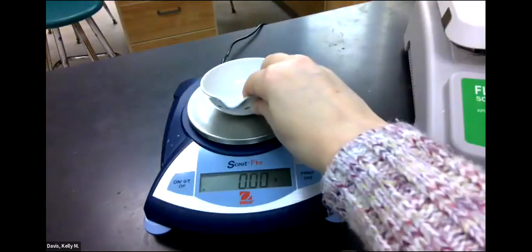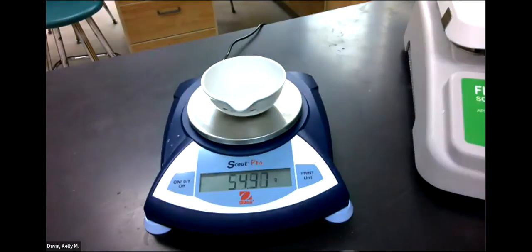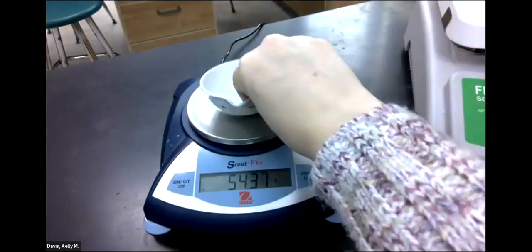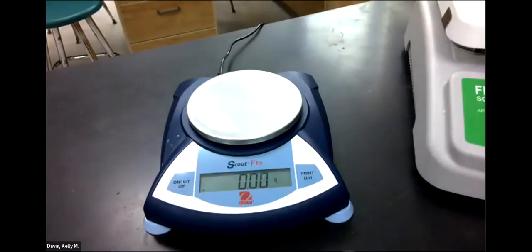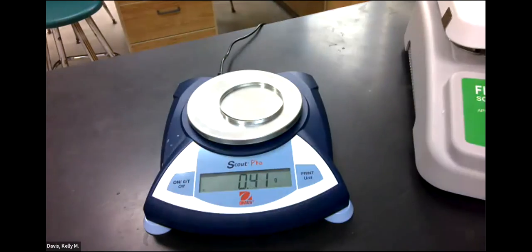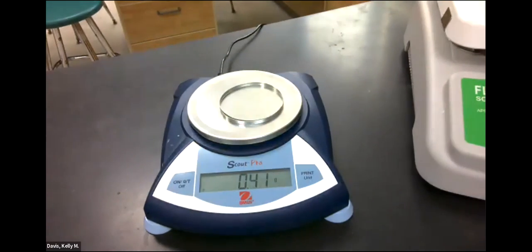So the mass of the evaporating dish is 54.37 grams. Okay, we're not going to need that till later, so I'm going to set that over here. And then I'm going to record the mass of the magnesium, which is 0.41 grams of the starting magnesium.